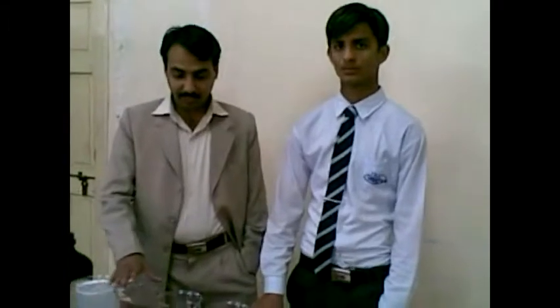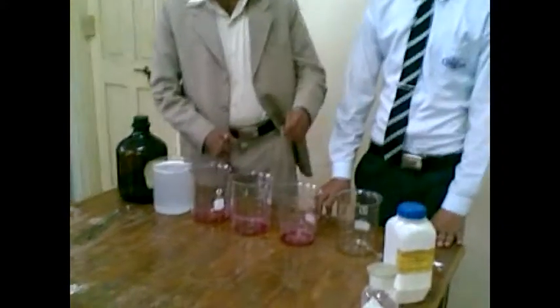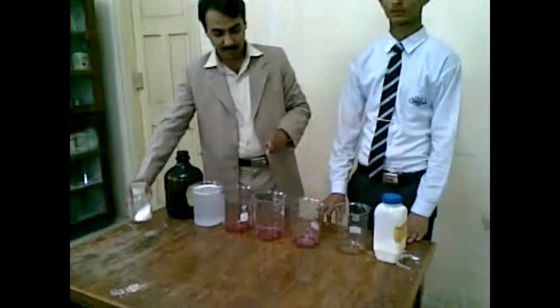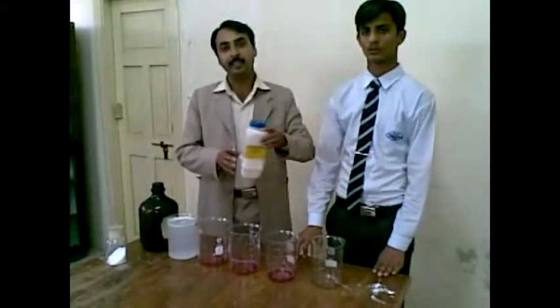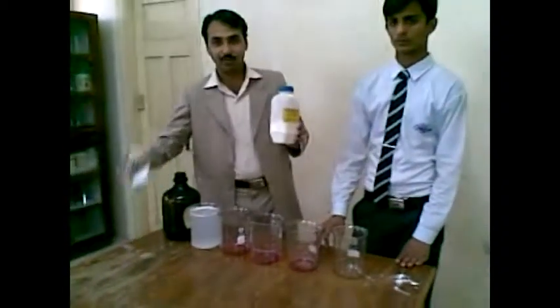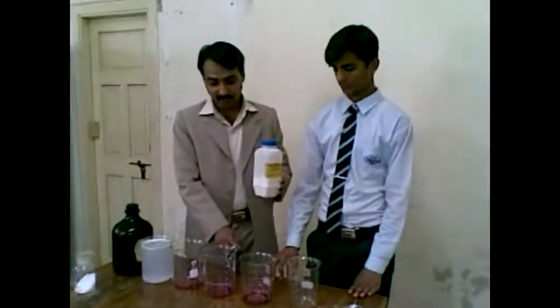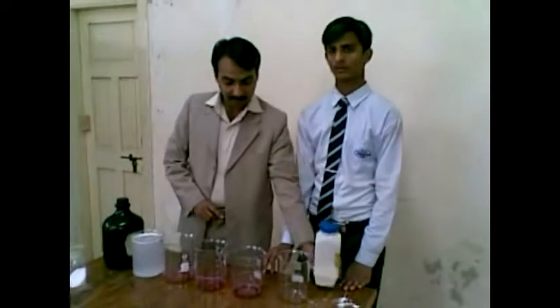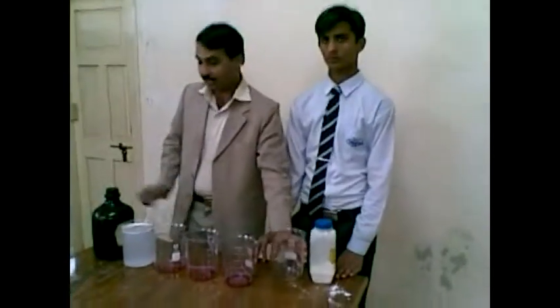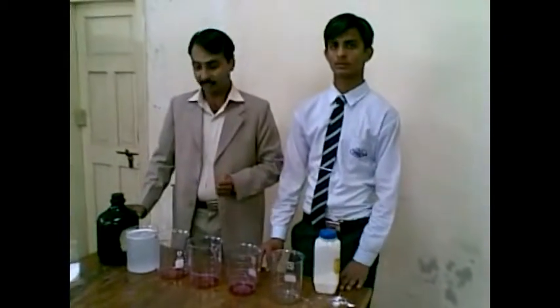He used five beakers in this practical. In the first beakers, he used sodium carbonate. Then he used phenolphthalein as an indicator, which causes the color of the water molecule to change with the help of sodium carbonate. He filled the phenolphthalein in the third beaker. In the last beaker, he filled the acetic acid, also known as ethanoic acid — a polar, nonpolar, and organic liquid.